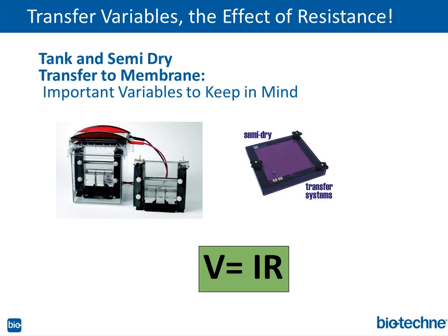So why do I have Ohm's law there? Well, I want to describe for you, this is basically the governing principle behind transfer, and it's very important. So look, you have tank transfer and you got semi-dry, and of course tank transfer, and years ago there used to be these huge tanks, right?